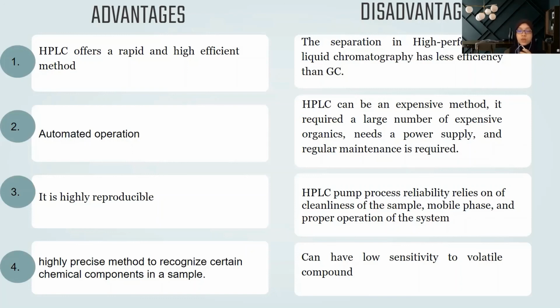Second, HPLC can be an expensive method because it requires a large amount of expensive organic solvent, it needs a power supply, and regular maintenance is required. An HPLC apparatus, even though it is much more efficient, is much more costly than other chromatography techniques.